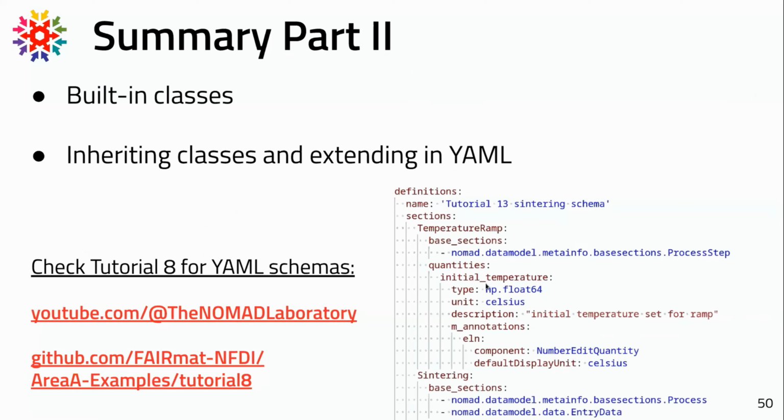So what do we gain from this? Writing 2 dedicated quantities for that makes this information machine readable. So we can access this initial and final temperature through an API call. And so when the quantity of our data is scaling, this is very convenient to fetch homogeneously whatever is available in our repository. Again, to take a better look at this, you can go to tutorial 8 and see our examples on this GitHub repo, or even on the YouTube channel. There are some more videos about that.